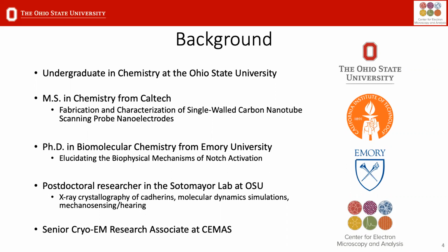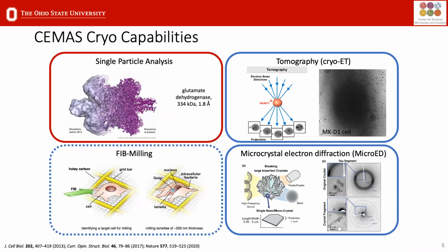I'm only going to be talking about single particle analysis and how to treat the data, but we offer a wide variety of cryo capabilities, including tomography and micro-ED, and we're also building a cryo-FIB milling capability. Those are all projects that we could help you with if you're interested.